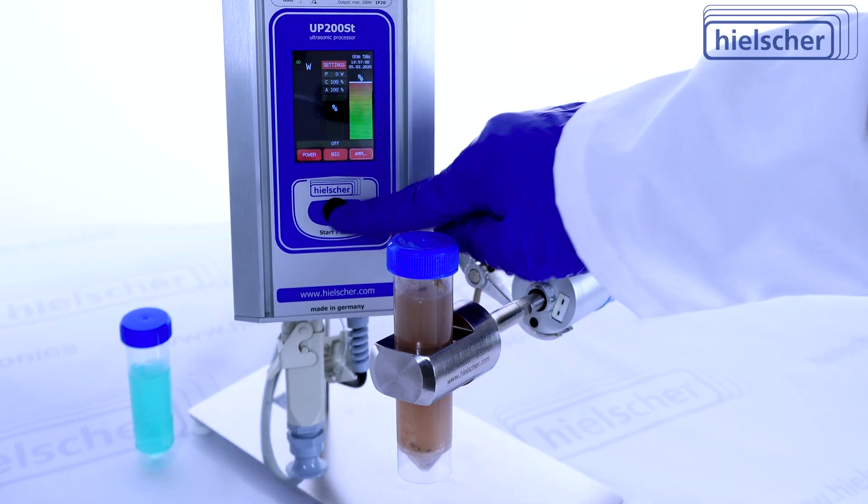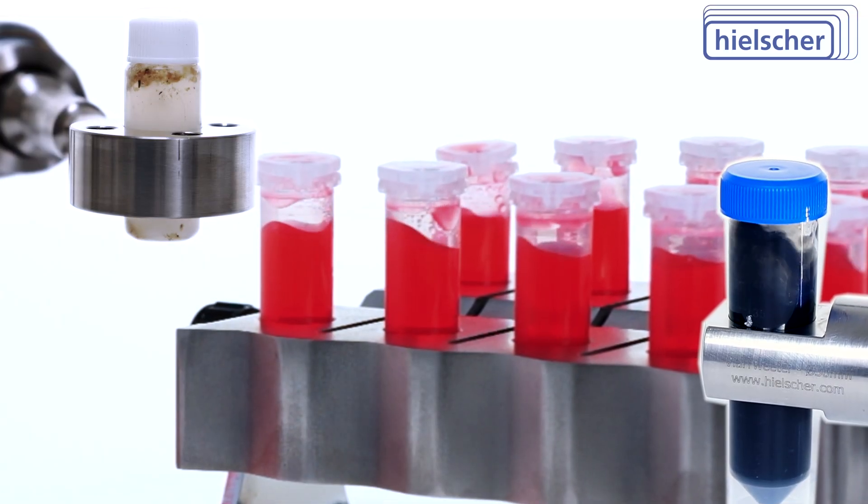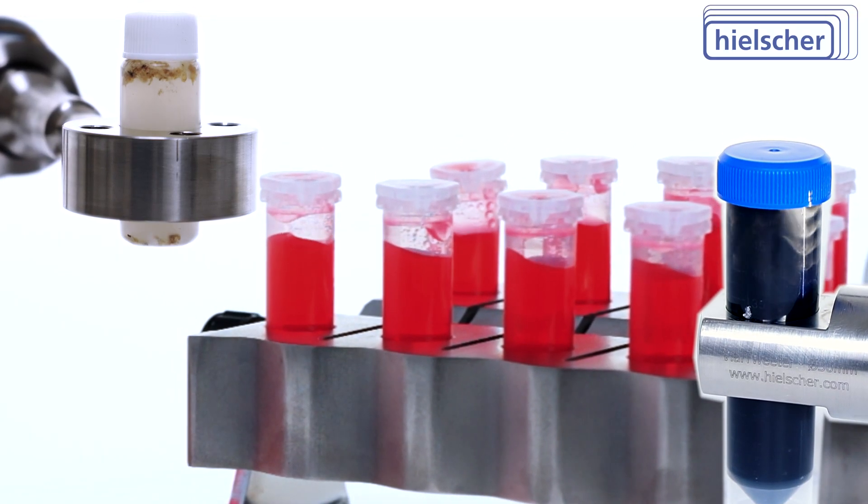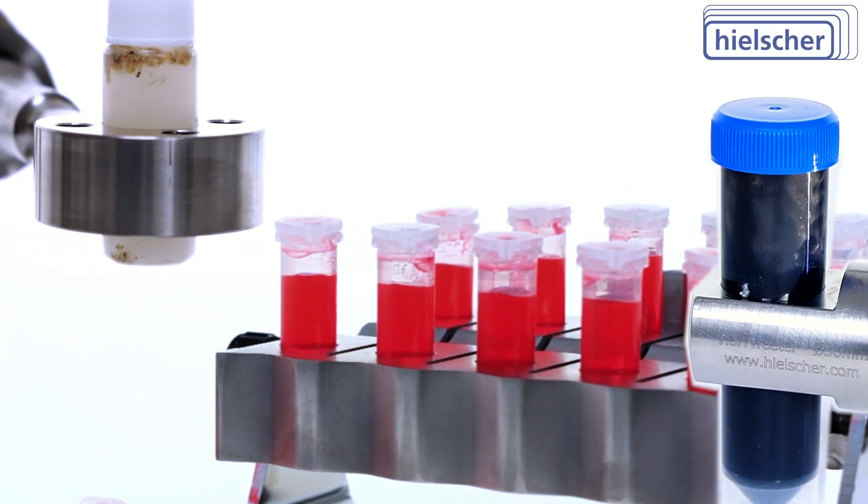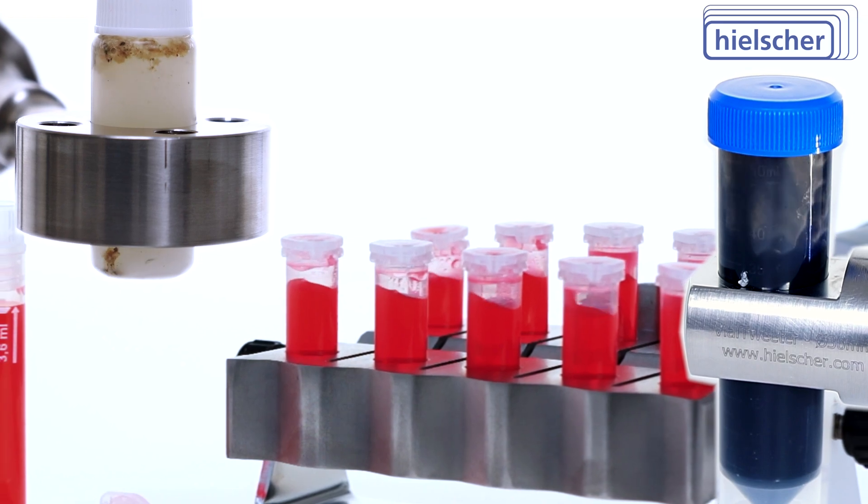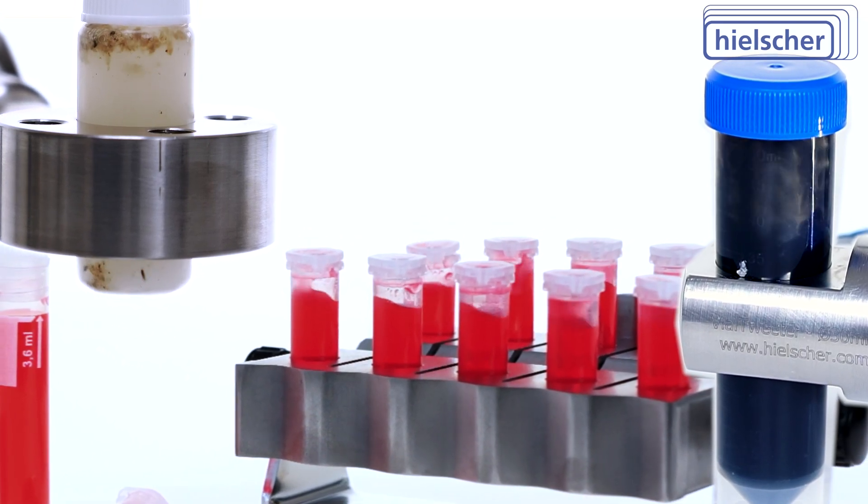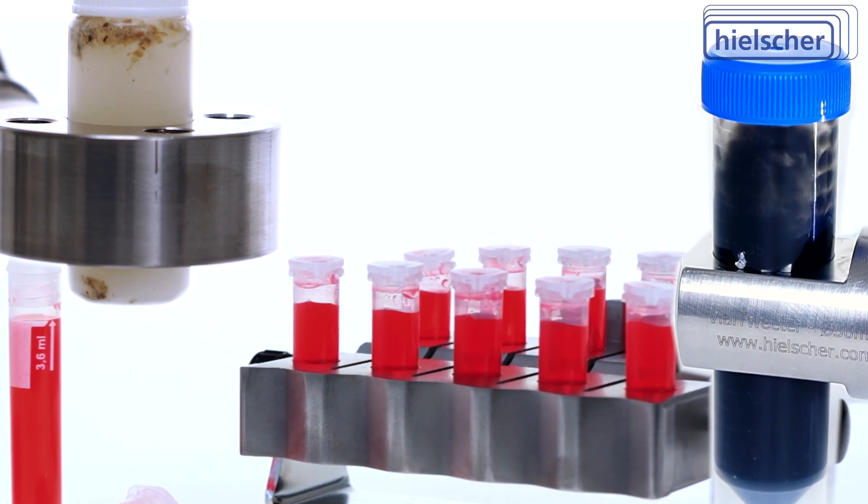The Vial Tweeter, in its various versions, provides the possibility to sonicate closed vessels. This reduces the risk of cross-contamination and aerosol formation. In addition, there is no need to clean the sonotrode between sonications.